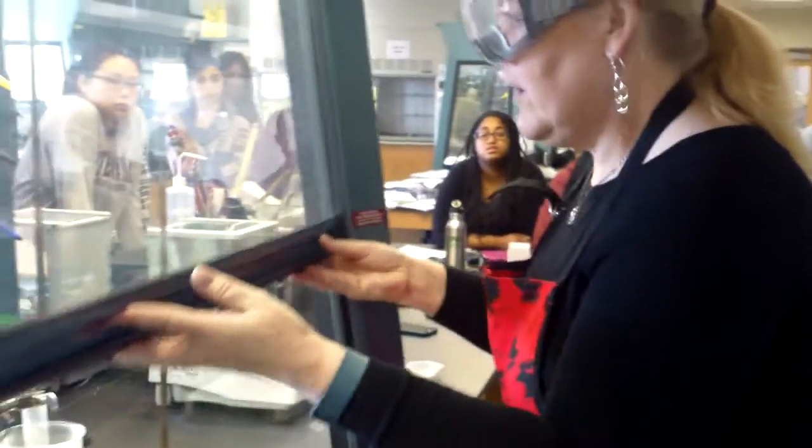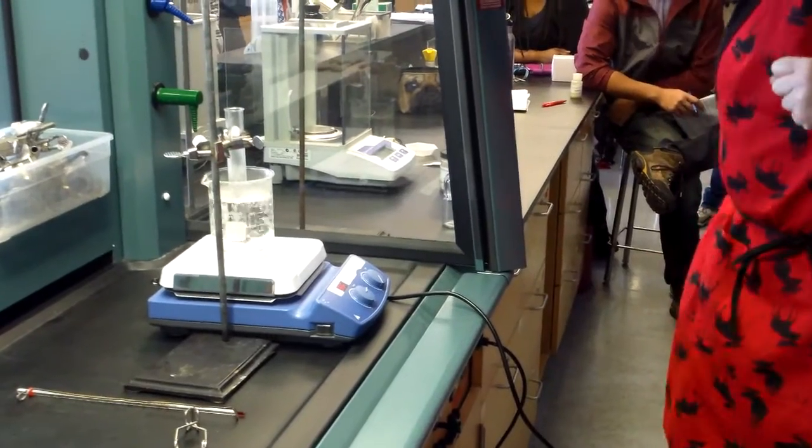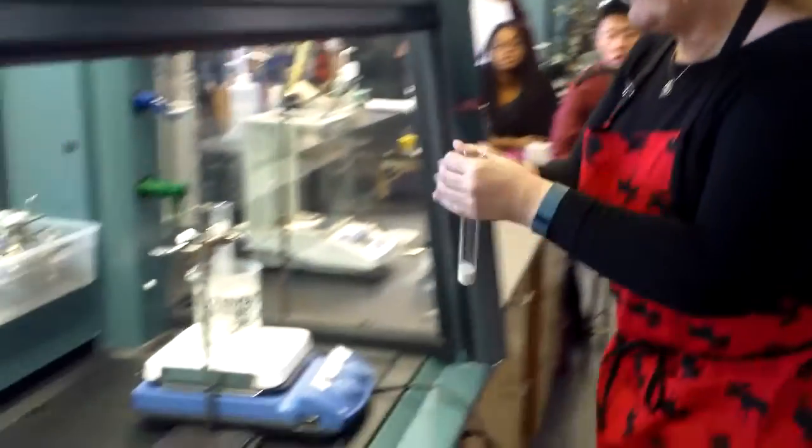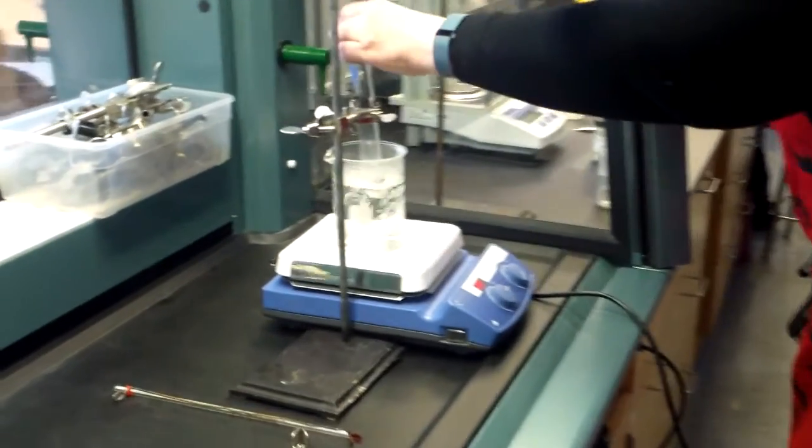Now, you will go to your hot water. As soon as you open these things, pretty much they're going to start beeping. And you're going to take your nice sample of solid naphthalene, and you are going to set it into your boiling water.